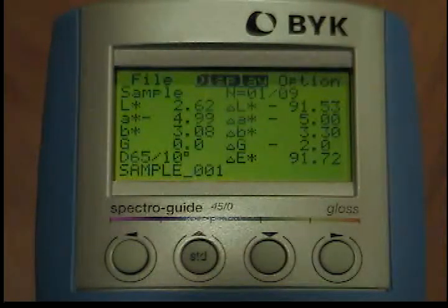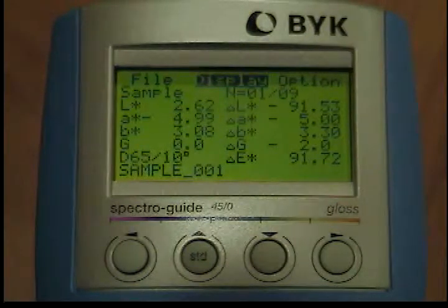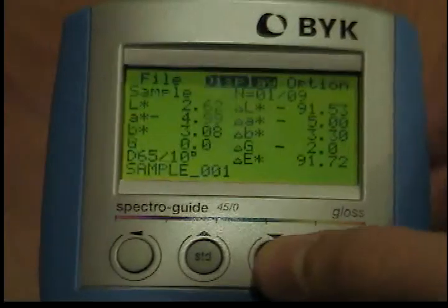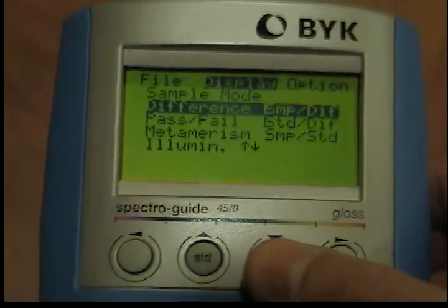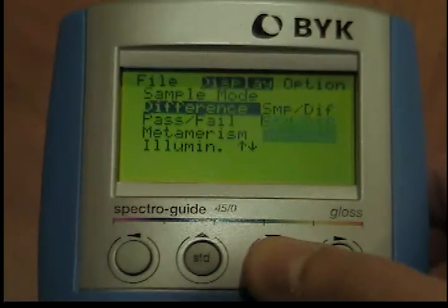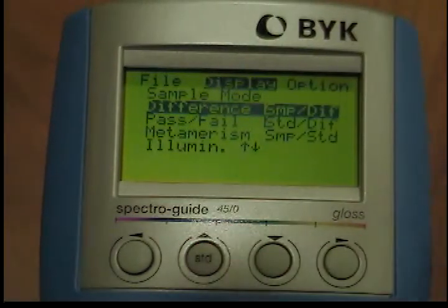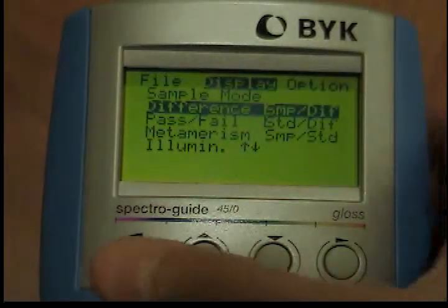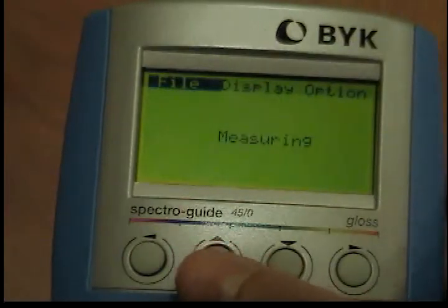This sample diff setting is preset. The following mode display options are also possible: standard diff, sample standard. To switch, use the submenu display differences. Then use the up button in difference mode to perform a quick standard measurement. The following message will appear on the display: Measuring standard.